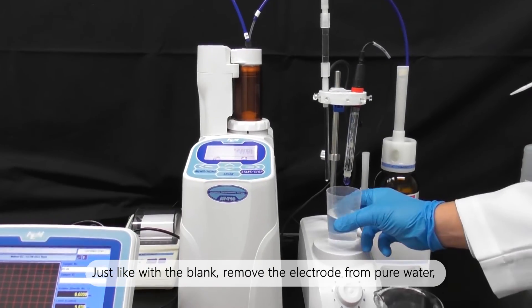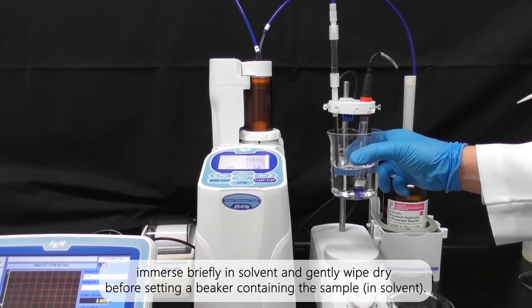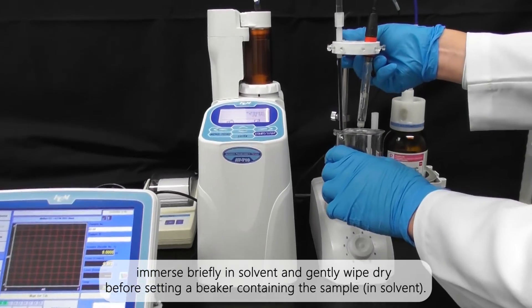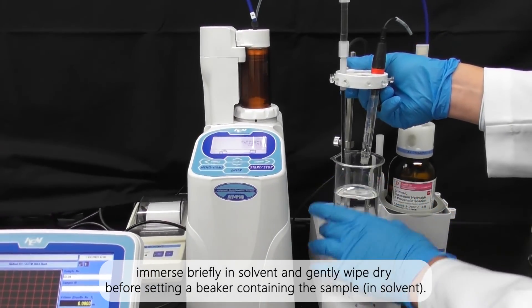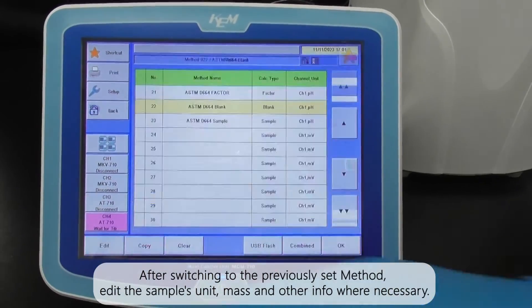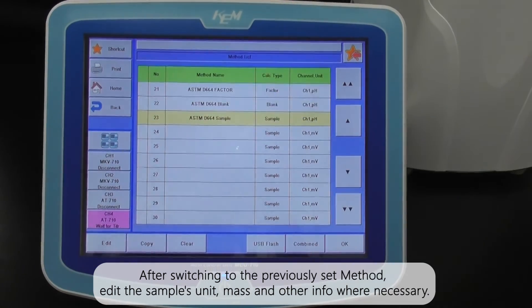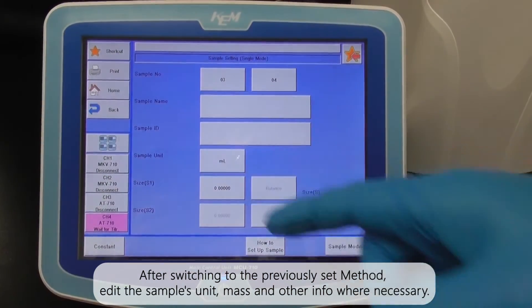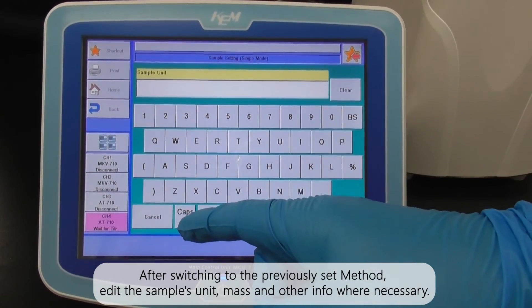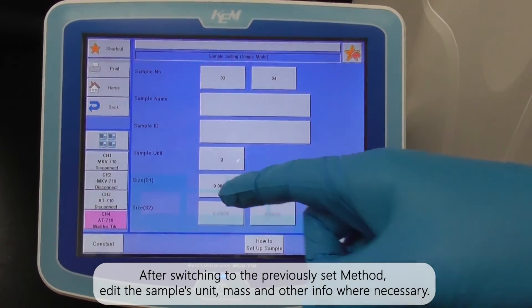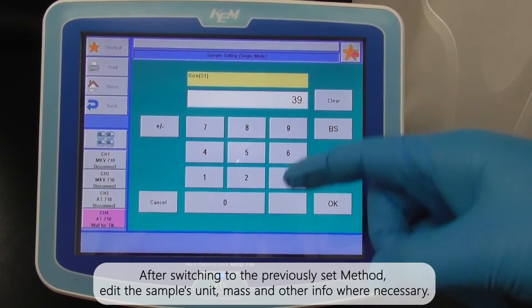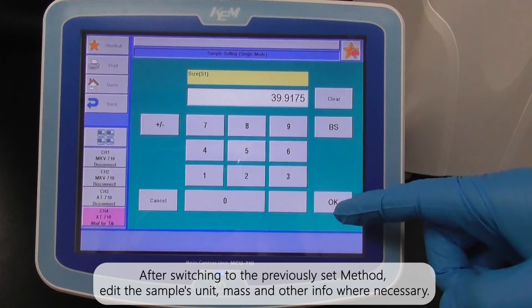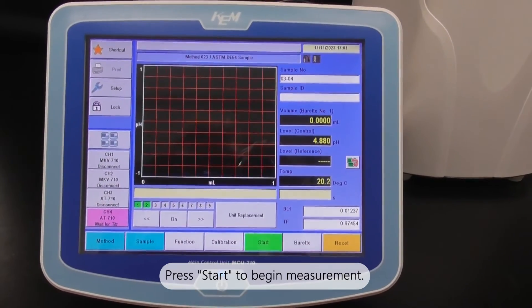Just like with the blank, remove the electrode from pure water, immerse briefly in solvent and gently wipe dry before setting a beaker containing the sample. After switching to the previously set method, edit the sample's unit, mass and other info when necessary. Press start to begin measurement.